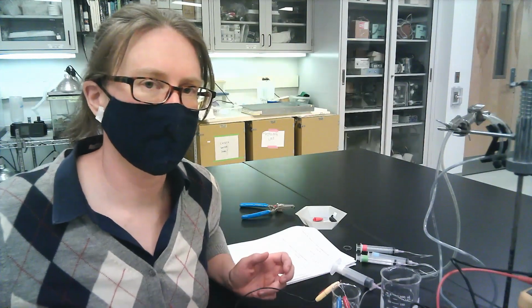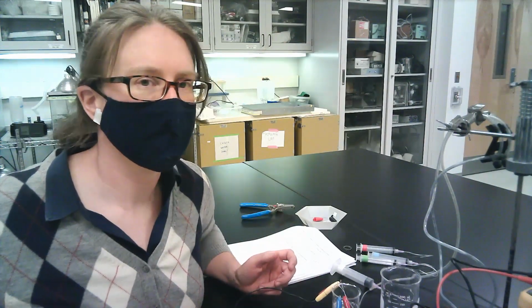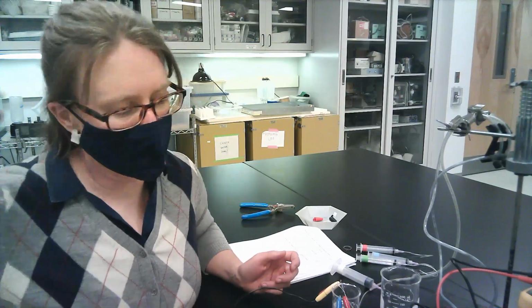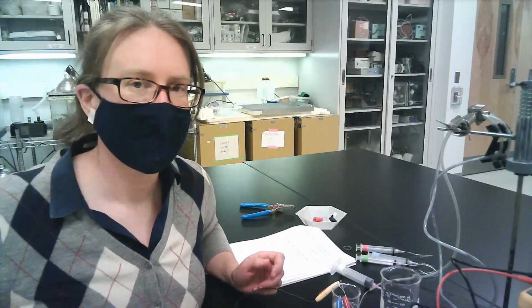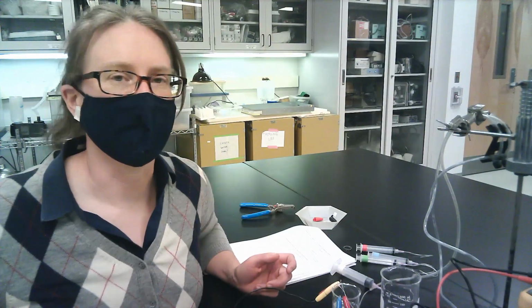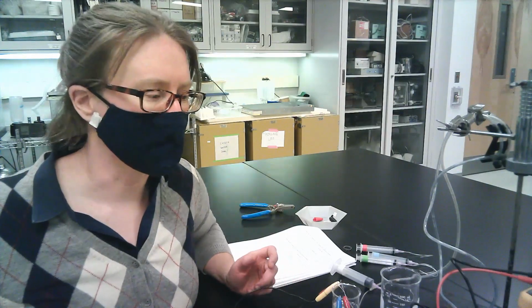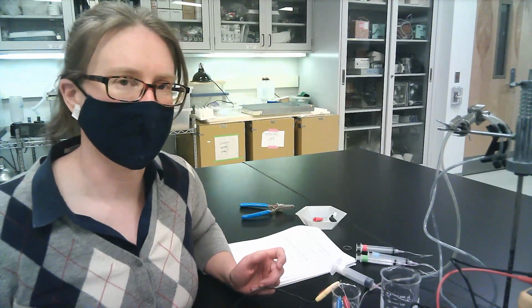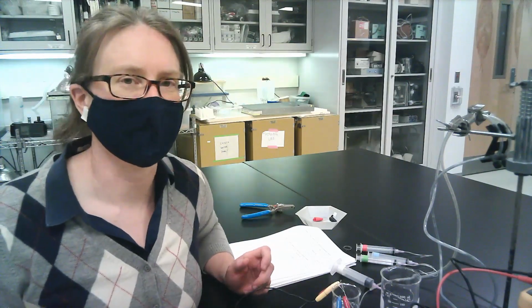And once you've finished manipulating the saline composition and concentration on your skin sample, then you're going to be adding amiloride and/or ouabain to either side of the chamber. For that, you're just going to pipette in a small volume of the amiloride or the ouabain, so just follow the directions that are in the lab handout.